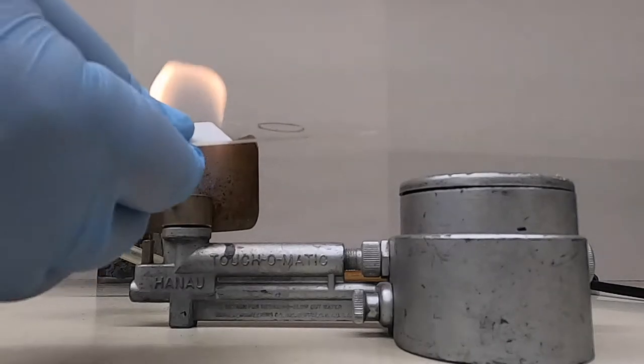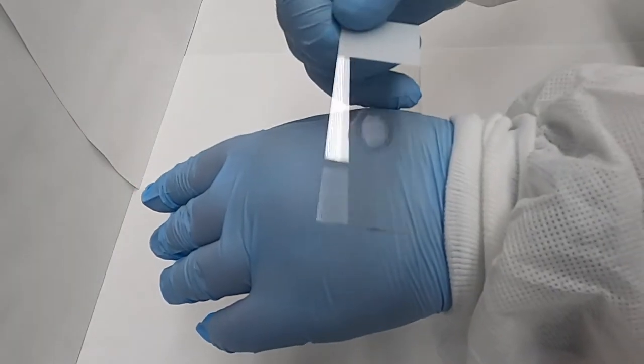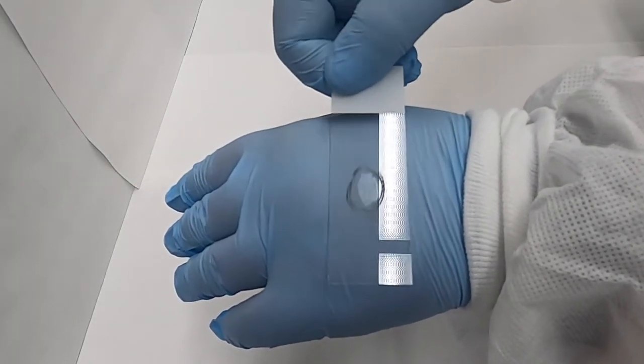The next step is to heat fix our slide, passing it through the flame several times. We're fixing it, we're not cooking the bacteria, so you want it to be warm to the touch but not overly hot.